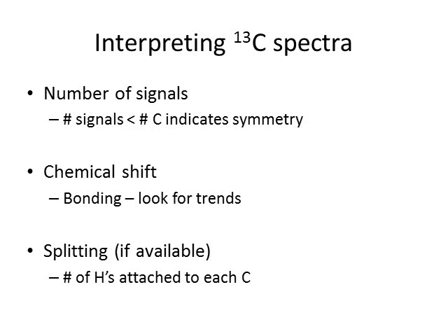On the other hand, if there is symmetry, like for instance take ethane. In ethane, it's completely symmetric. The 2 carbons are identical to each other. If you turn the ethane around, you couldn't tell the difference. So therefore, those 2 carbons, since they have exactly the same arrangement of bonds, have exactly the same energy for that transition, and therefore they only give one signal for ethane. So if you have symmetry, you will see fewer signals in the spectrum than carbons in the formula.